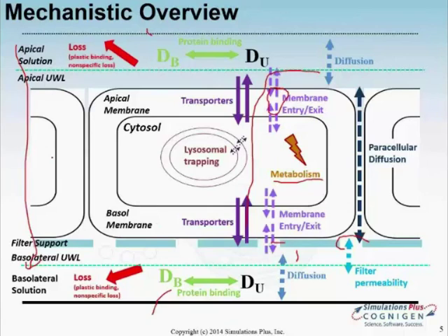And speaking of binding to plastic, we do have also additional processes to account for this kind of non-specific loss of the compound from the system, either by binding to plastic or any other losses that would be affecting your measured permeability or measured concentrations on apical and basolateral side that you can account for. And we also account for possible evaporation of the compound from the apical side.